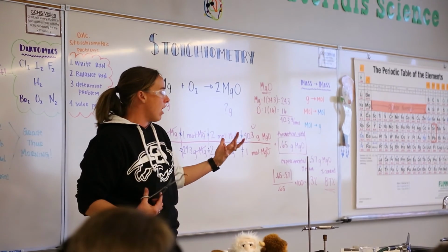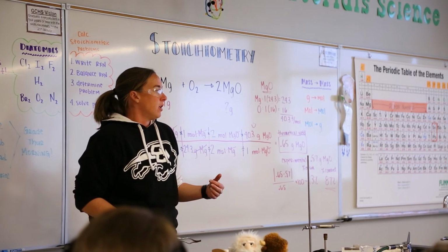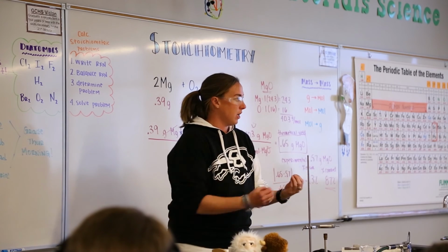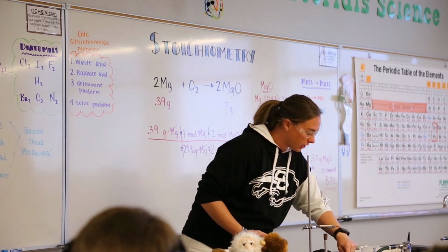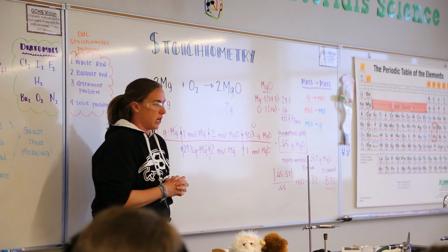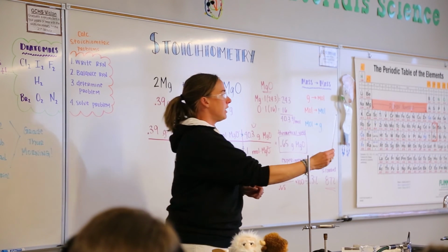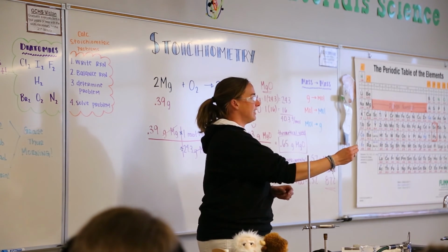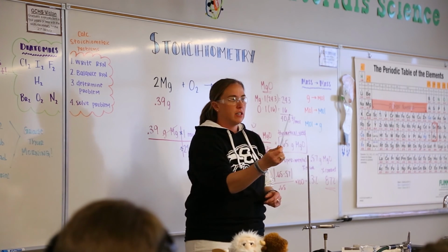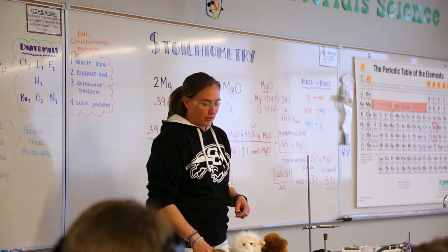So how could we have lost some material? What did I do during my experiment? I blew on it, right? What happens when you blow down onto something? Powder goes out, right? And if you look, there's a few little dust particles around here. That would make our weight lower. What else would make our weight lower? Banging it with a stick, right? The glass stirring rod that I used to crush it has a little bit of particles on it. So that took out our weight there as well. So that's probably some of it.